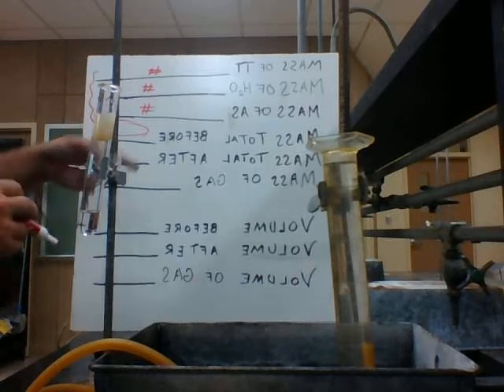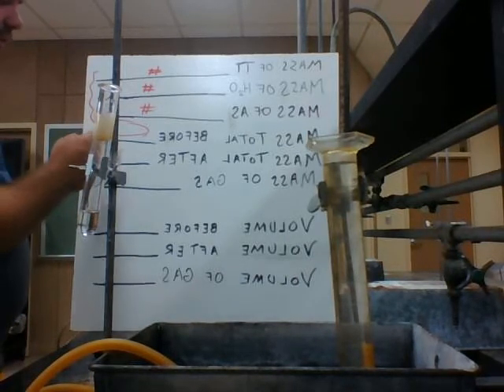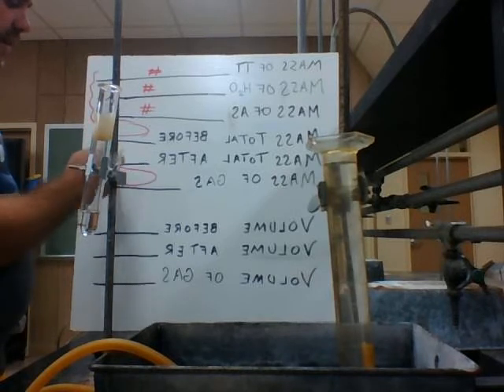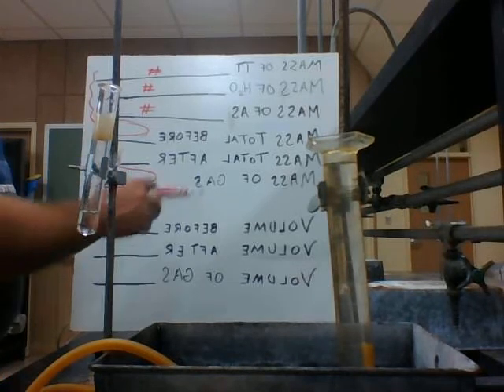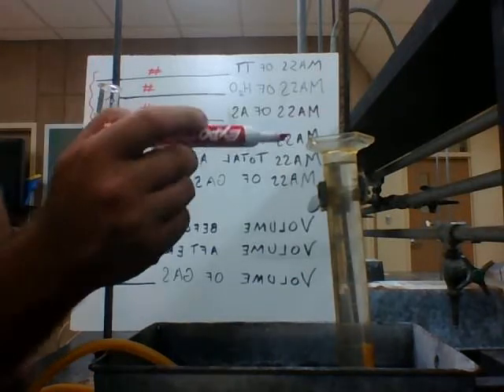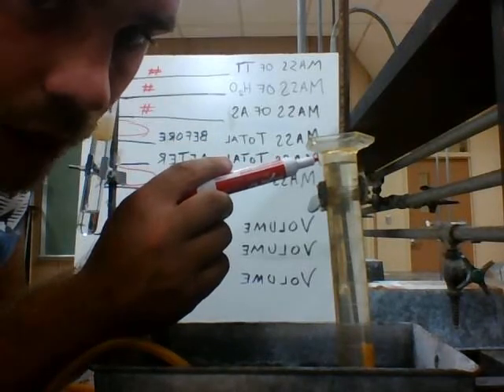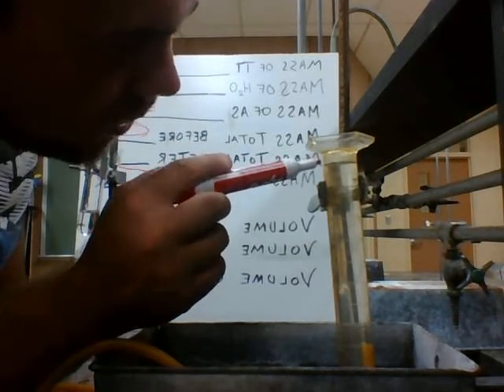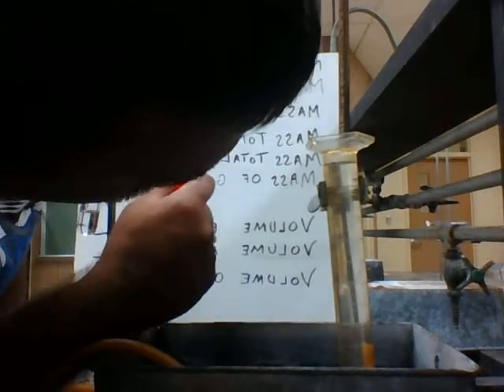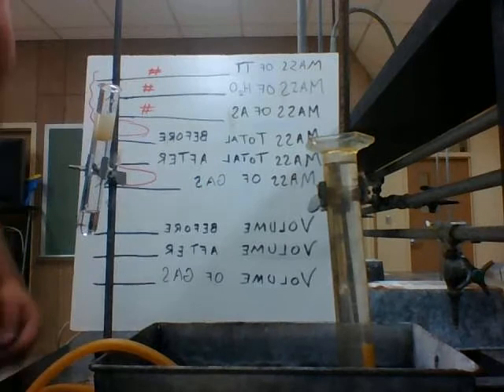We won't worry about mass total after, but the subtraction of these two should give me the mass of the gas. To get the volume before, that's what I have here on the graduated cylinder. It's kind of difficult to see, but the line of the water is right there. I should read that to one decimal, and I'm reading it approximately 5.9.